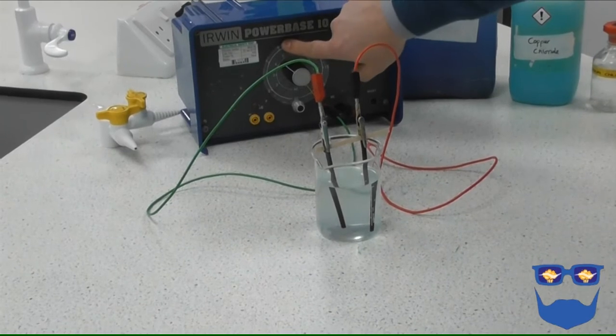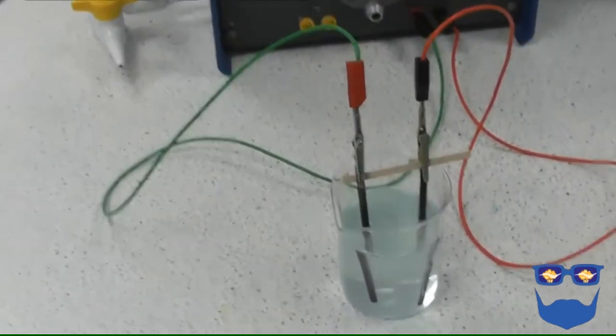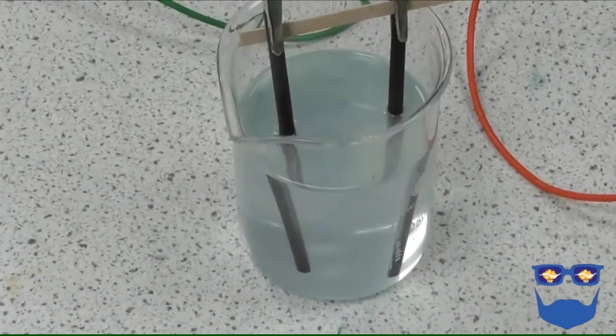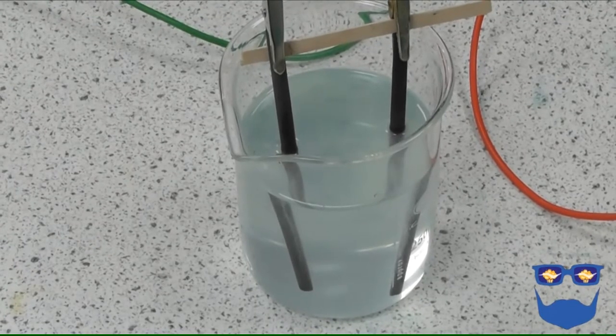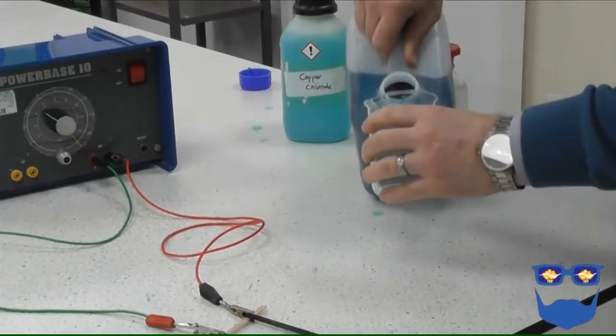Turn on the power supply. 6 volts should be sufficient. Leave for 30 seconds and observe the effect on each electrode. Turn off the power supply and repeat with the 3 other solutions.